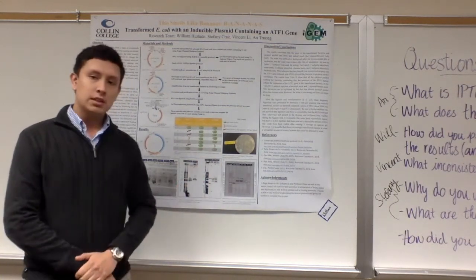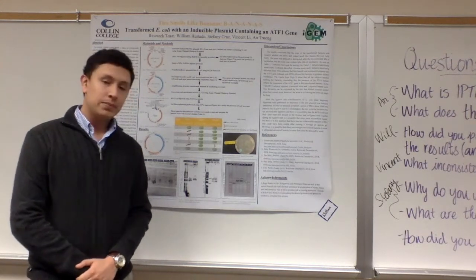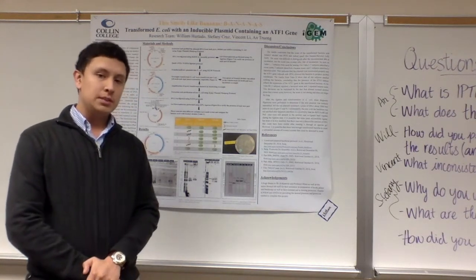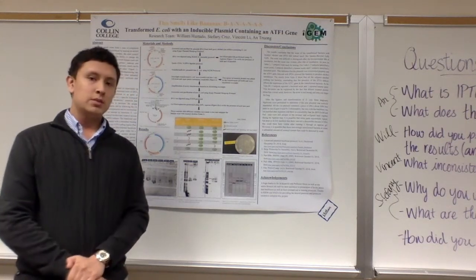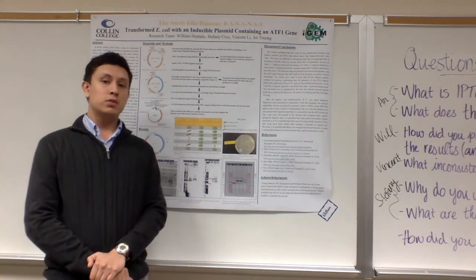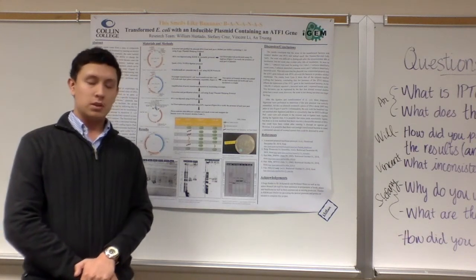We believe this is because the mixture of the isoamyl alcohol and IPTG does create a sweeter smell. However, this smell will not linger because the bacteria is not transformed, and therefore the banana smell is not constantly being produced.